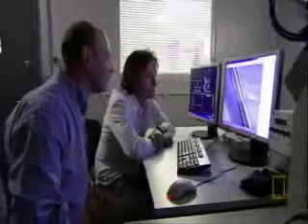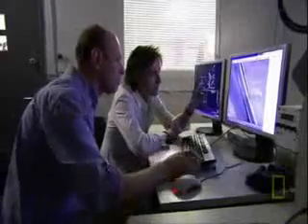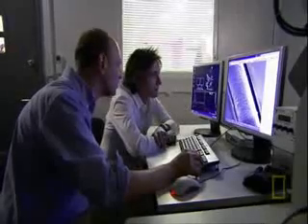Exactly. In the interests of science, one of my hairs volunteers as a guinea pig. Ow! That's my hair. That's one of your hairs. Yes, that's where you've glued it down with some glue. Yeah, and there's your little hair sitting across there. So how close can we go with this thing? Oh, we can get in there and look a little more closely. And we can see the size of your hair.